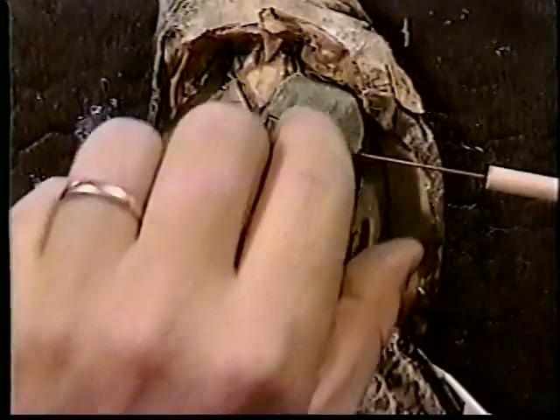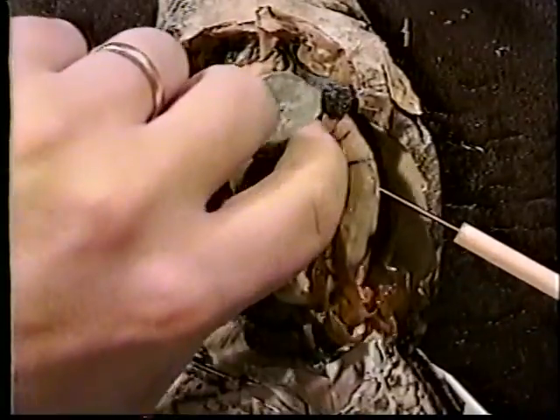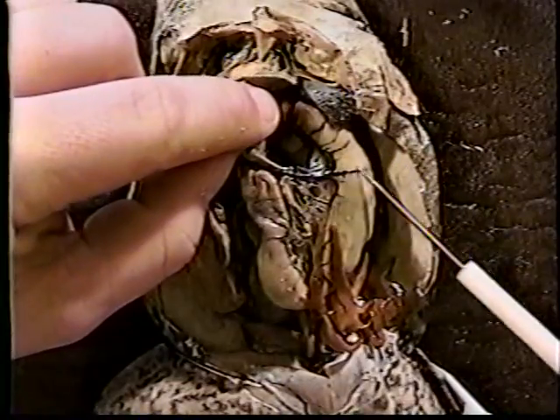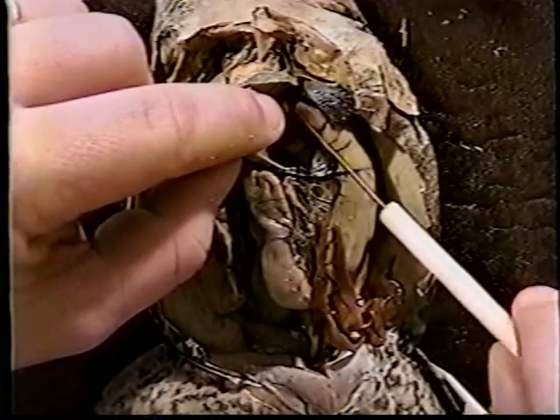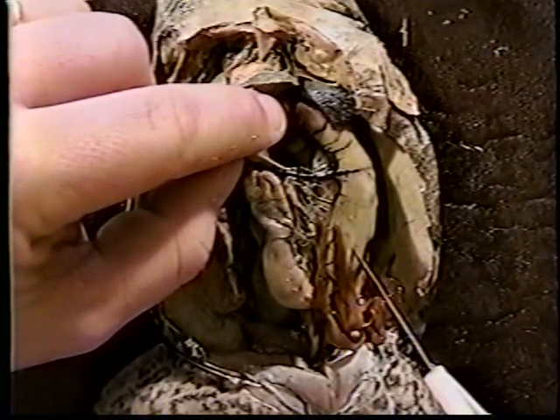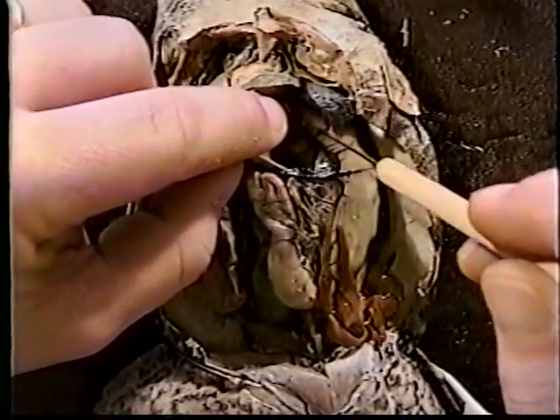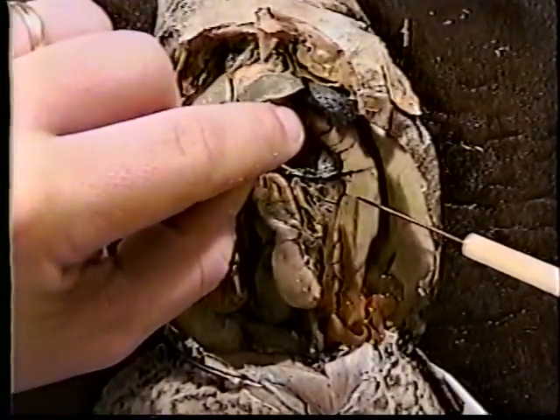As we re-examine the stomach, we find it is long and tube-like, and when brought out, runs in a banana-like curve. This is where most digestion in a frog occurs. And as we poke at the stomach, we find it is a very coarse, hard organ designed to digest a variety of foods.